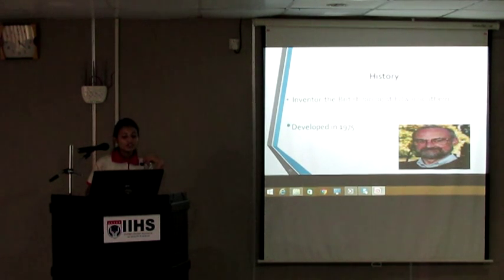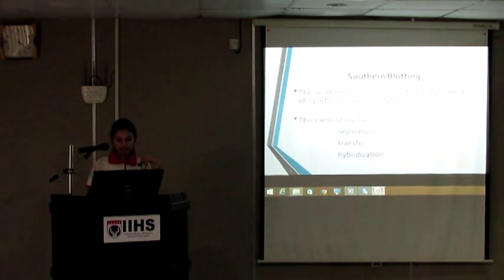Moving on to the history, the Southern blotting technique was developed by E.M. Southern in 1975. Southern blotting is used to detect the presence of a particular piece of DNA in a sample, as well as to verify the presence or absence of a specific nucleotide sequence from different sources.